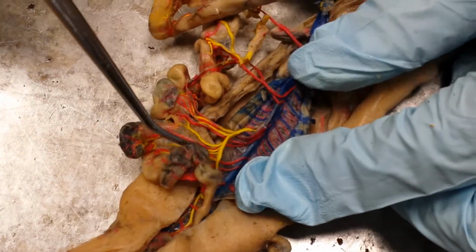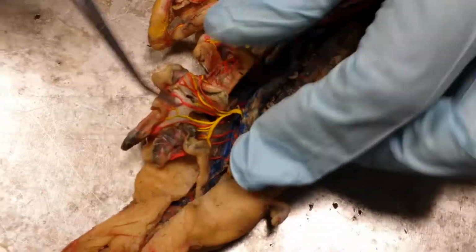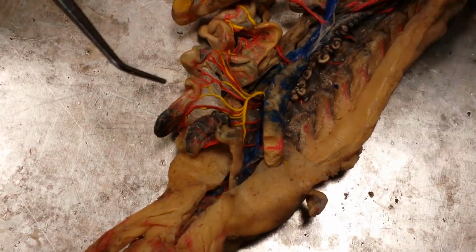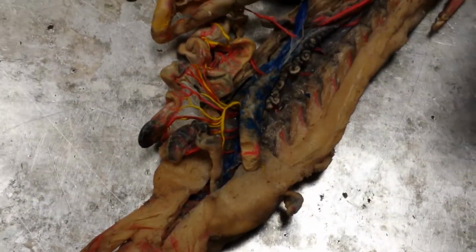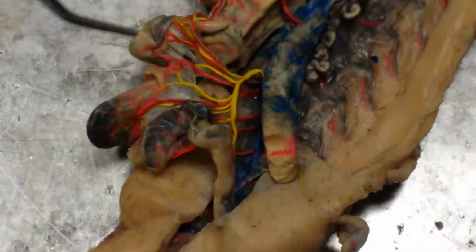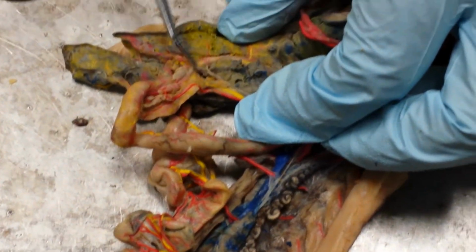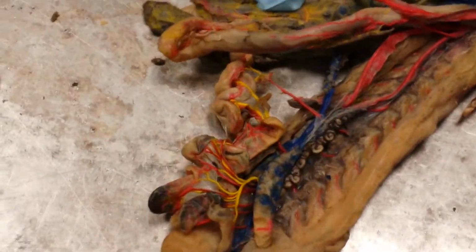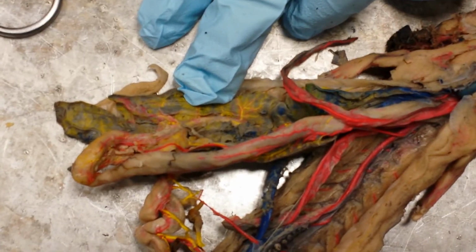Okay, and also blood that's draining from your digestive tract flows through these yellow vessels, and it says that the digestive tract is part of the hepatic portal system. So everything from the digestive tract is being shipped to the liver through this big vein right here. So if you flip over your liver and look at the ventral side of it, you'll see this big yellow vein, and that's the hepatic portal vein.